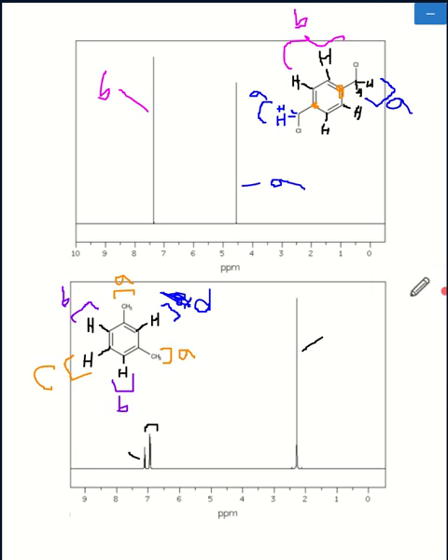Therefore, we'll label the rightmost peak as environment A to signify the hydrogen of these methyl groups. Now, what can be observed is that essentially we have these two main peaks around 7 parts per million. And 7 to 8 parts per million, those are going to be for hydrogen that are directly connected to a benzene ring.